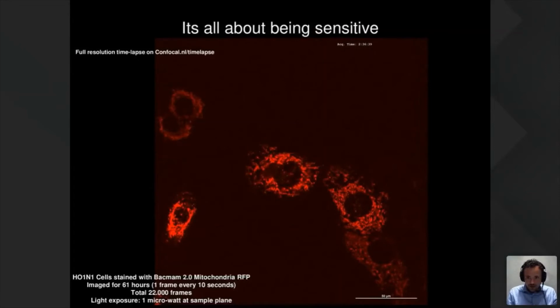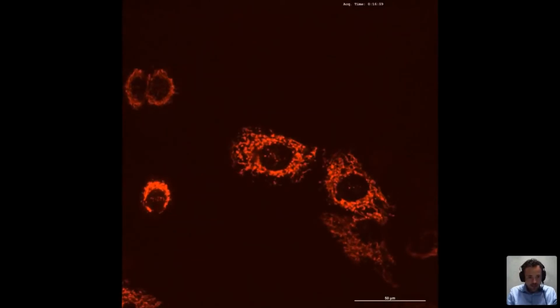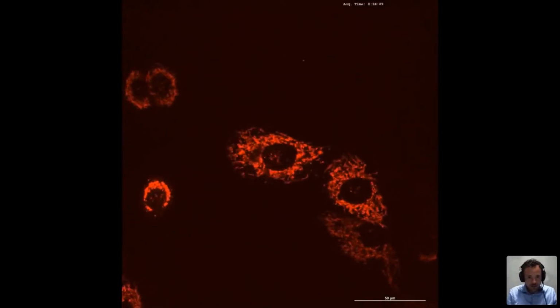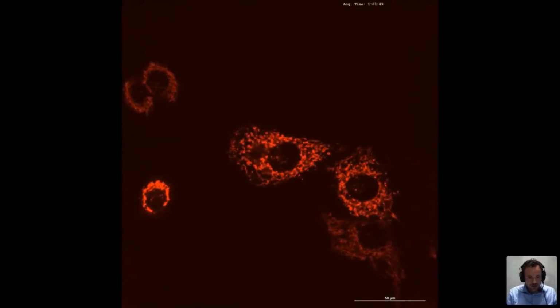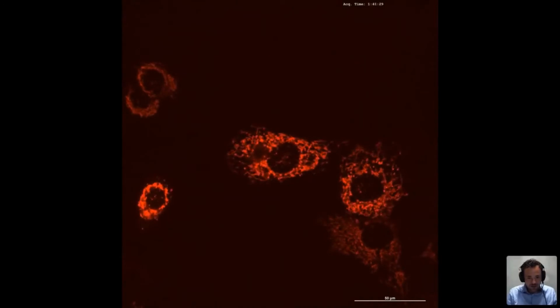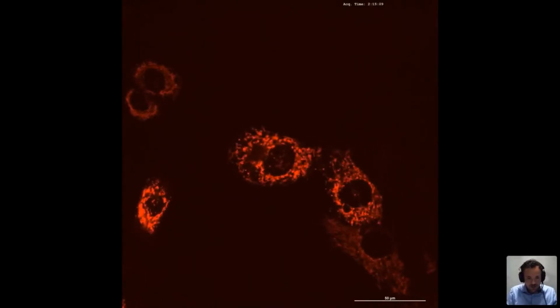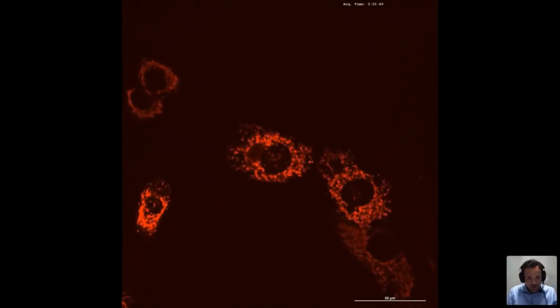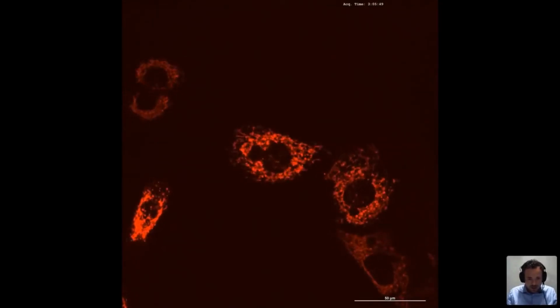So here is another very nice movie which we recently made. This shows mitochondria being imaged for 61 hours with one frame every 10 seconds. So in total, we acquired about 22,000 frames. And I want you to see that there's absolutely no bleaching here. The cells are completely happy. Some of them even go into mitosis. So you will see this in a bit.